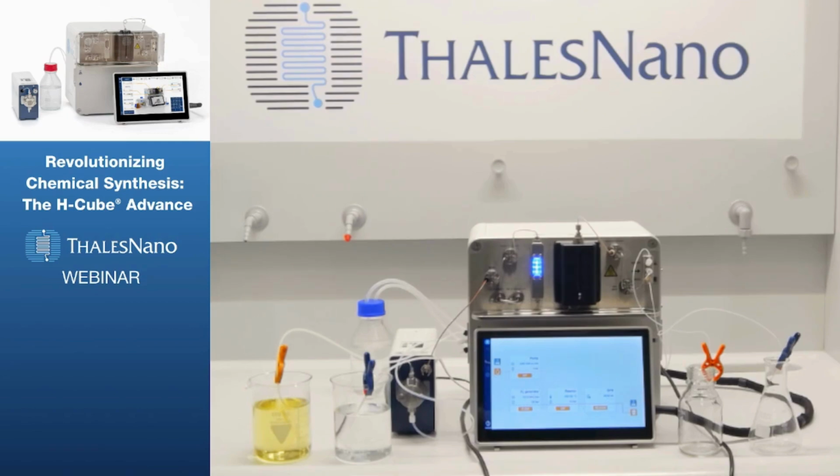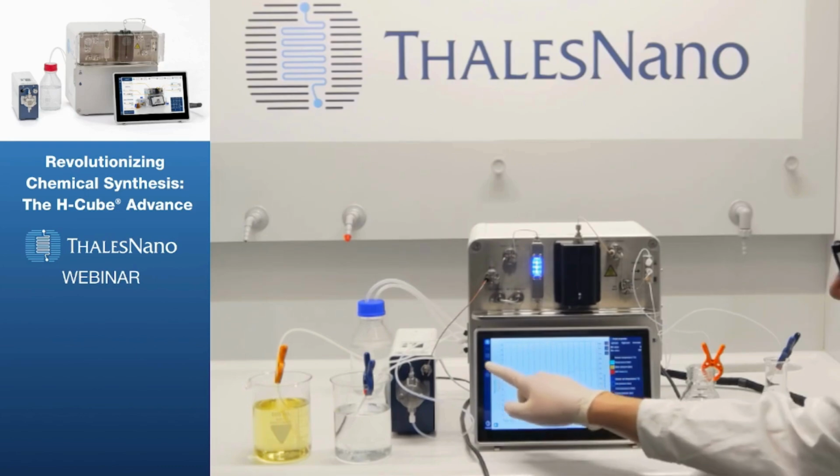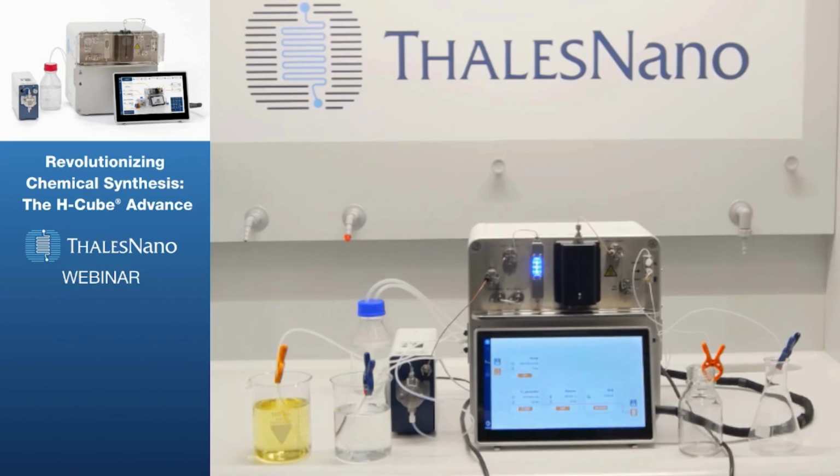Now we have achieved what we call the steady state of the instrument. All of the parameters have been reached and it has stabilized. If we now go to the graph screen, you will be able to see nice and flat lines. Of course, not here on the camera, but when you look at the screen live, it will display the stable state and stable condition of all the set parameters. And if we go back to the manual operation, now we are ready to start the real experiment.